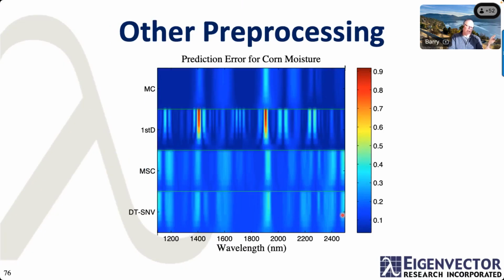And you can also look at it as a function of what pre-processing steps you've done. And I really want to point out the difference here: this is the mean-centered model. Here's a model with a first derivative. And derivatives, for instance, will really pick up on narrow features that get added to things. So they are somewhat less robust than models without that.